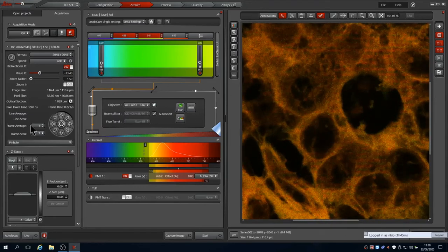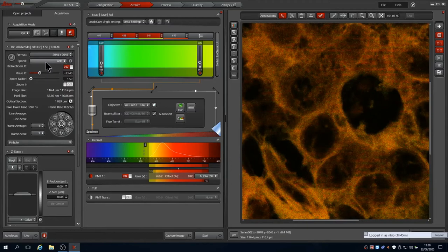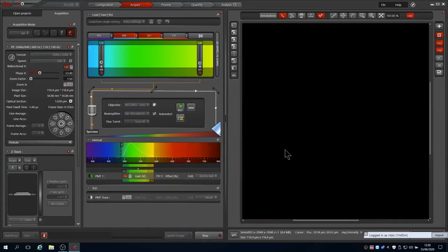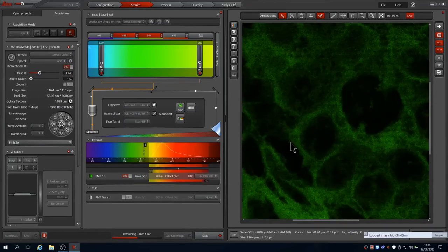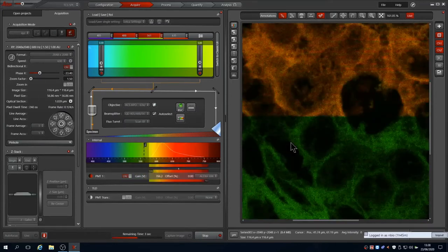We can tackle this with either the scan speed or averaging each pixel. Here we'll try averaging three times. This captures the image three times and returns the average signal per pixel.